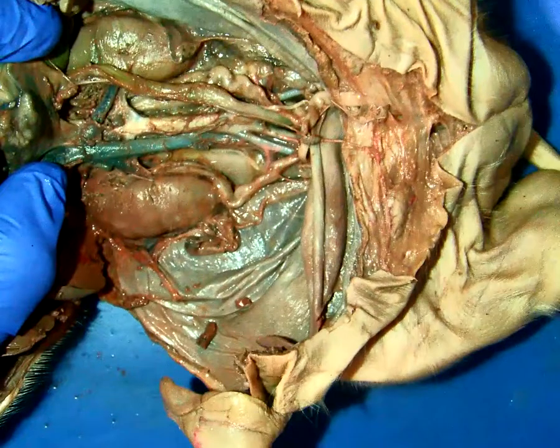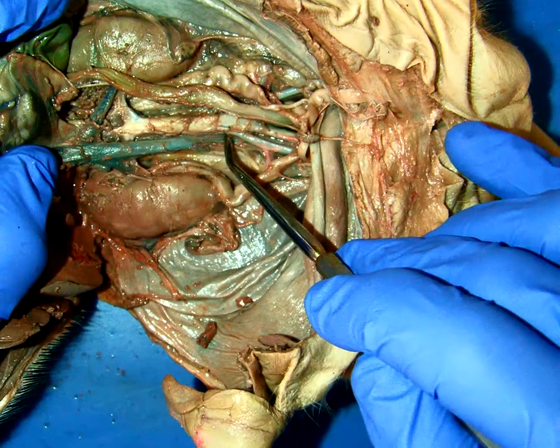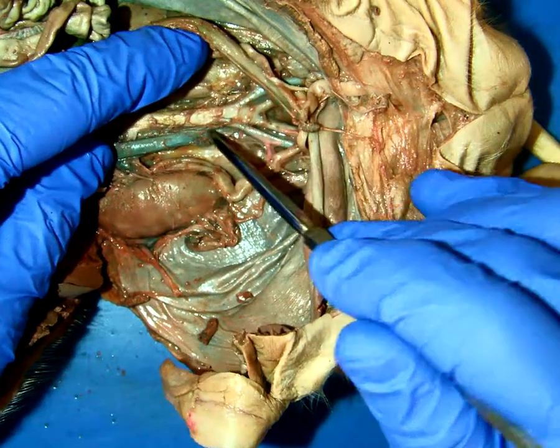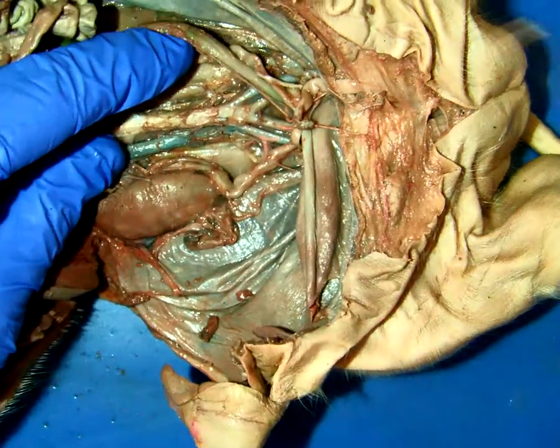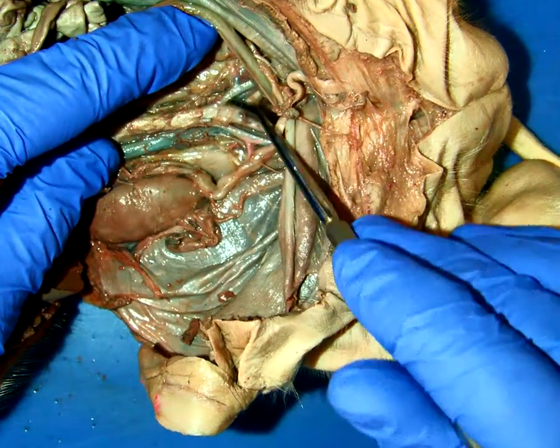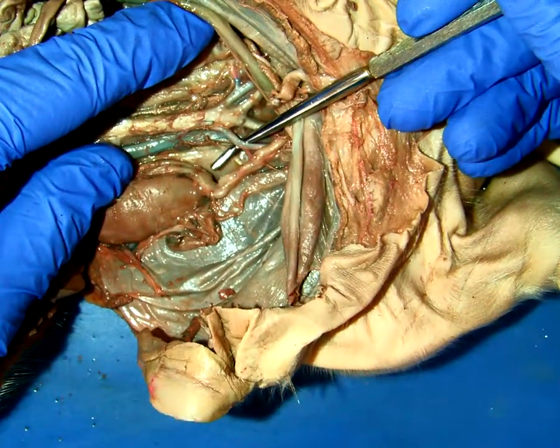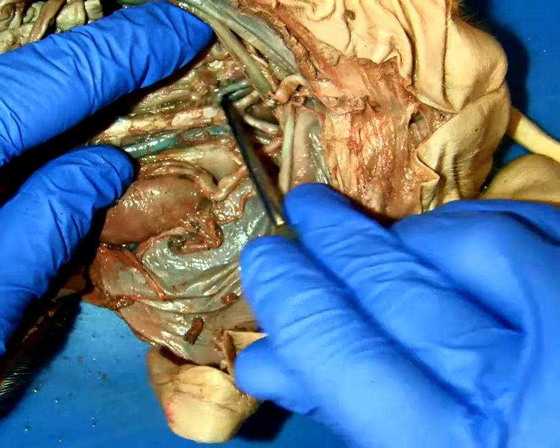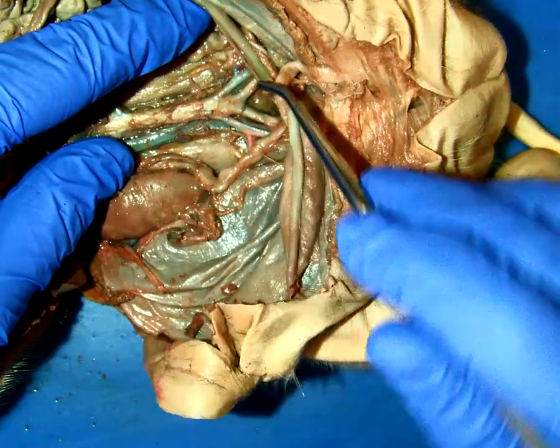All right, so here, following the branch, the straight tubes right here, so our inferior vena cava going down, our descending abdominal aorta coming down, they then branch. Okay, so in the pig, we have another discrepancy here, just like we did with branches on the aorta. So here as we're going into the lower limbs or legs, we have a branch here, and then a little continuation on. So technically this is the right external iliac artery, and this is the left external iliac artery. And then these would be the internals.